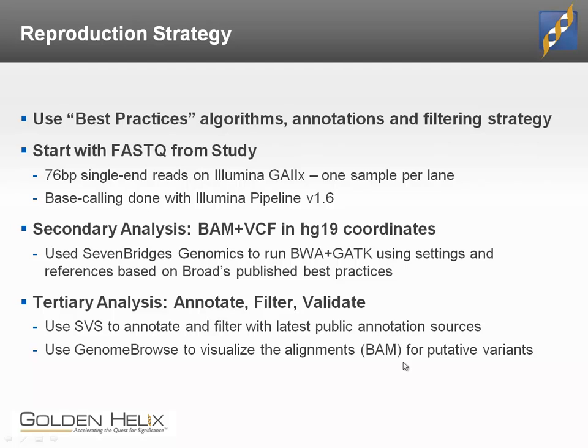The nice thing is, when you open this up in Genome Browse, that is so apparently obvious as you look at it. You would slap yourself on the forehead and say, all right, I'm not going to use that variant for anything that important, or I would need to do something dramatic, like in the case of our HLA region, simply use a different technology to get to those variant lists.